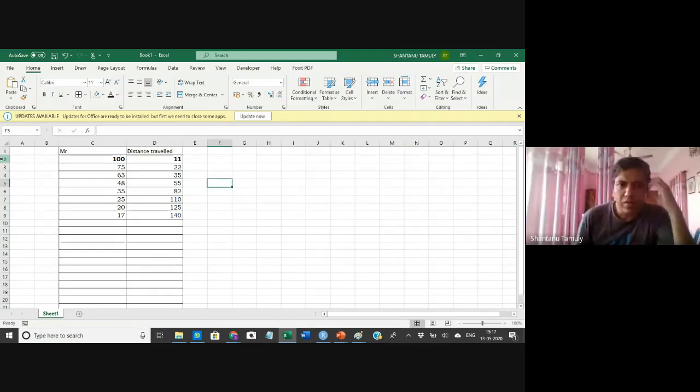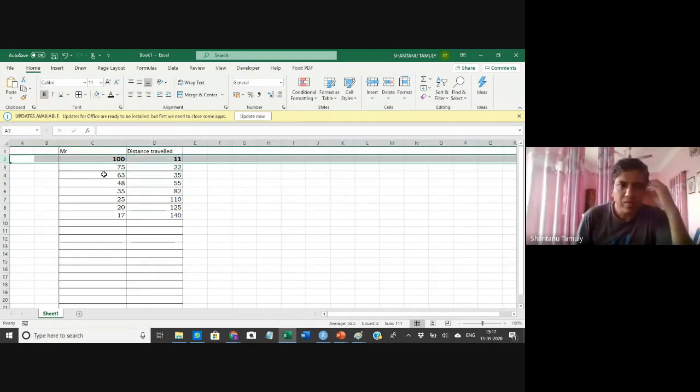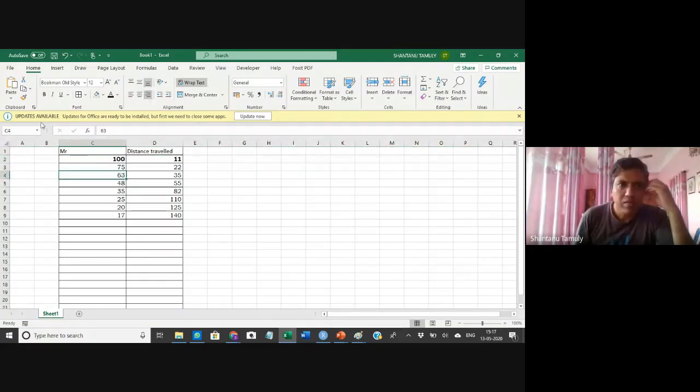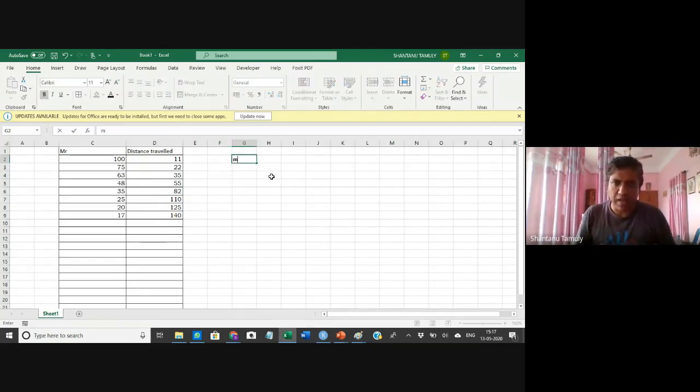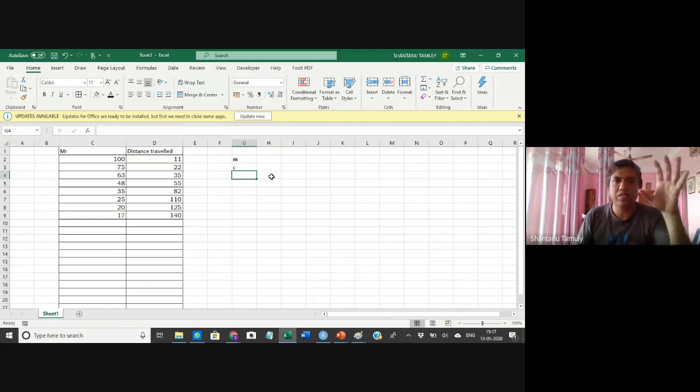Now our next aim is to determine the molecular weight of our test band. But before that, our first aim is to determine the value of the M and the value of the C. Once we determine this, then it will be clear that we just put the value of the distance in there and you will get the answer.